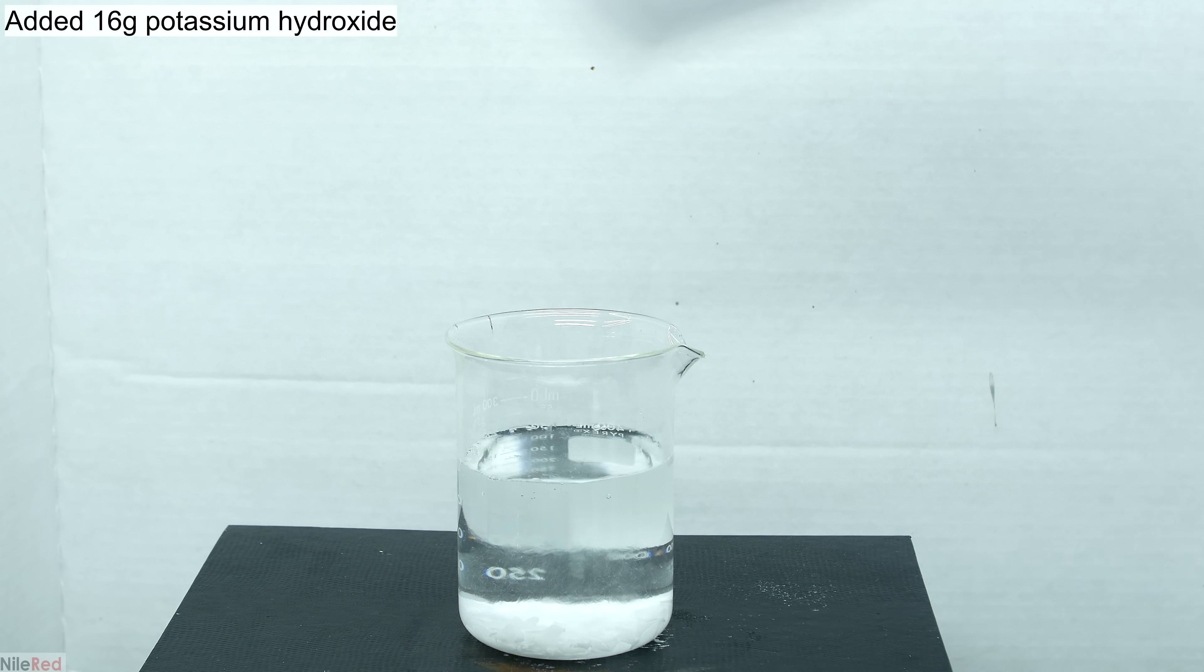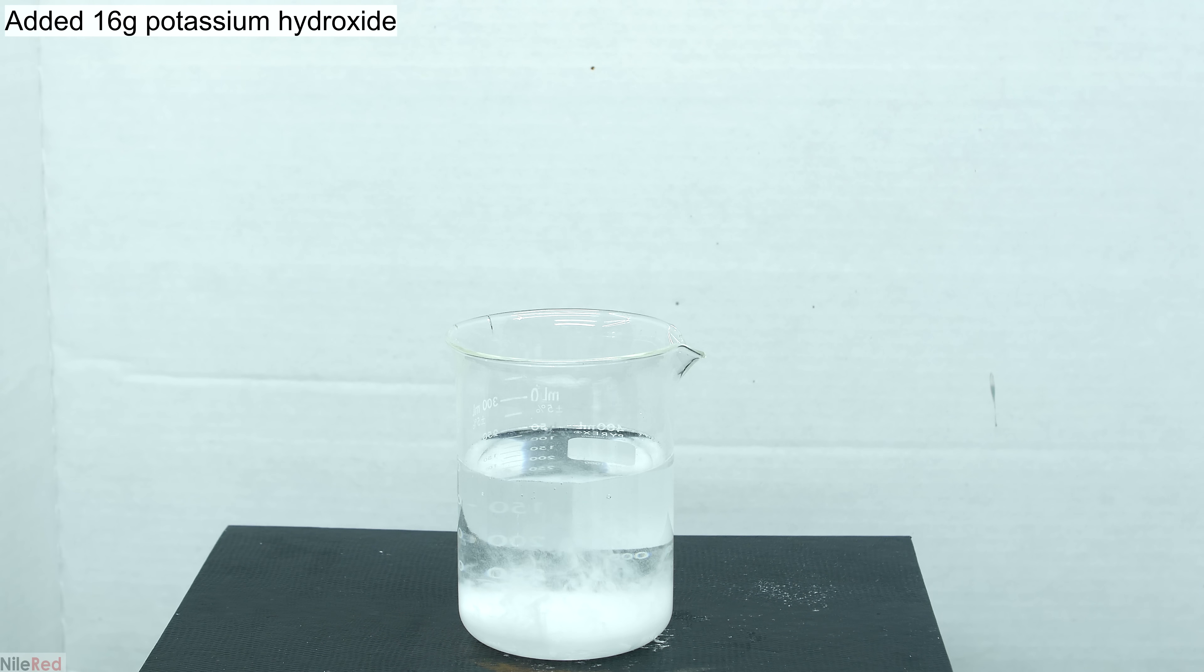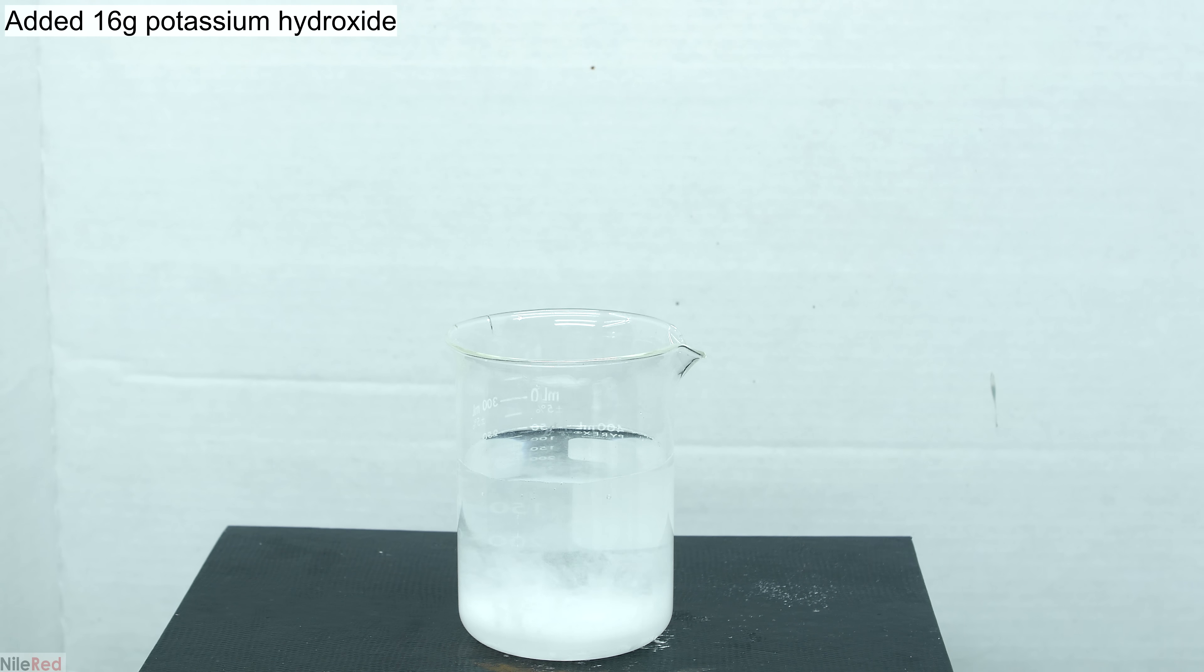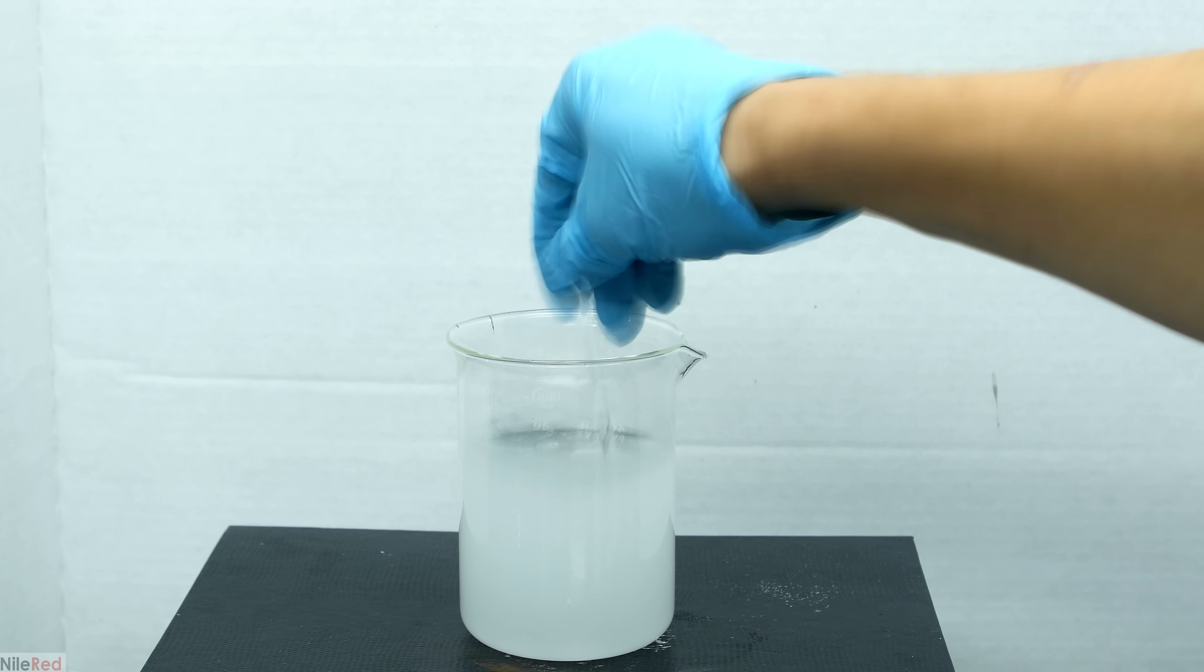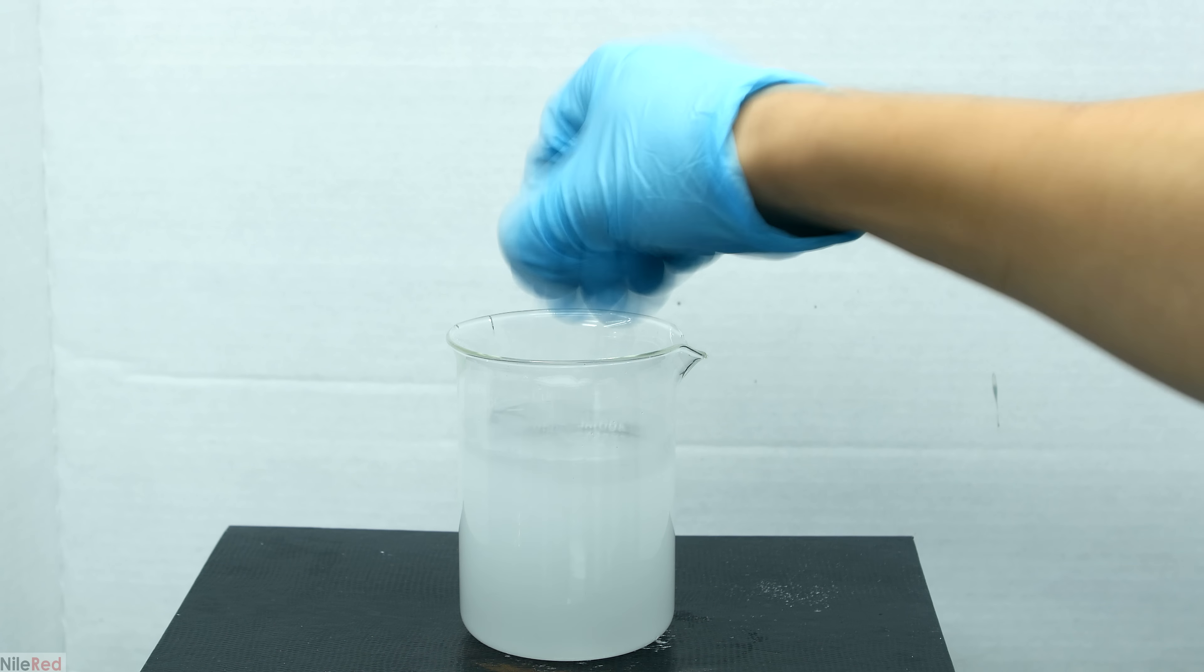We start off by dissolving the 16 grams of potassium hydroxide in about 250 milliliters of distilled water. Using a glass stir rod I mix things around until all of the potassium hydroxide has dissolved.